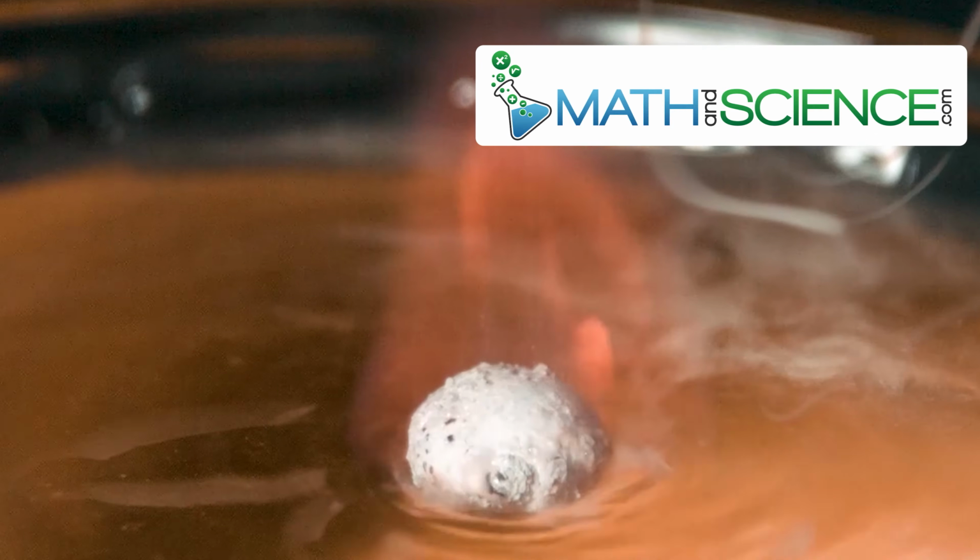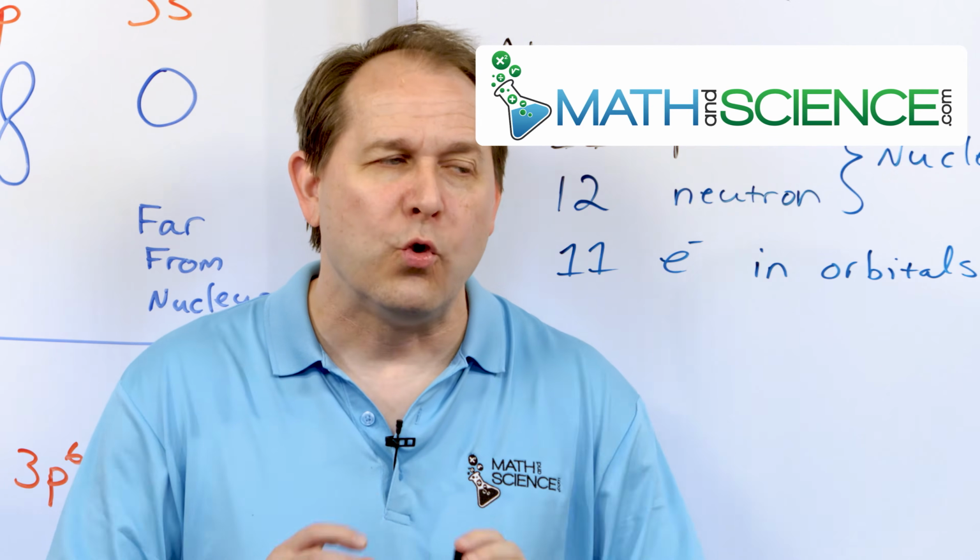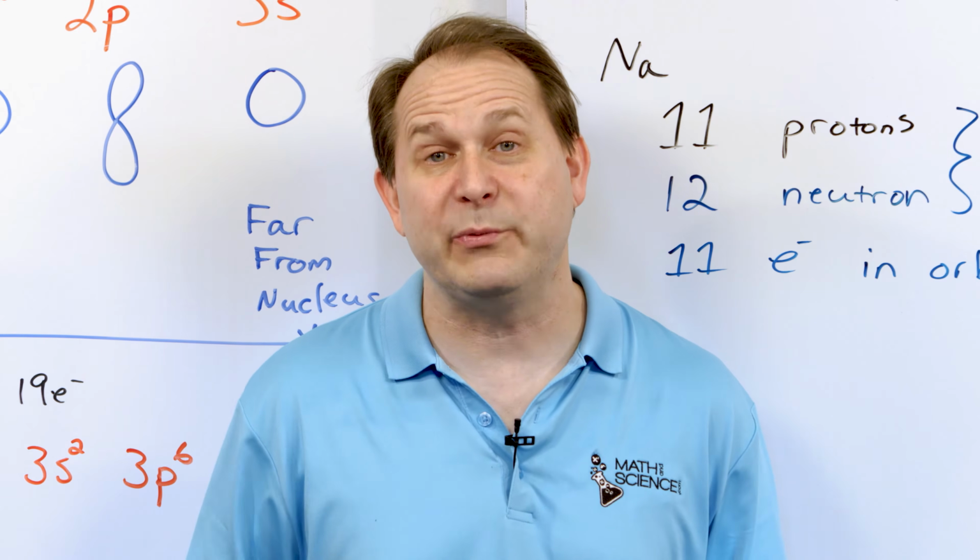Today we're going to take potassium metal, drop it in water, and watch the chemical reaction, the fire and the explosion that happens as a result. We'll film it in slow motion and try to learn as much as we can from it.